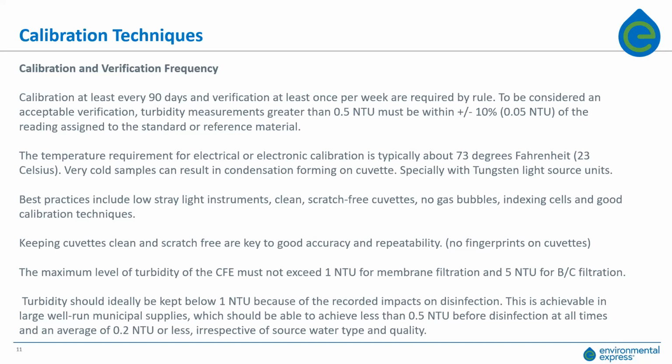So it's usually not a condition. I just like to point out to be careful with very cold water samples when using a white light tungsten light source.